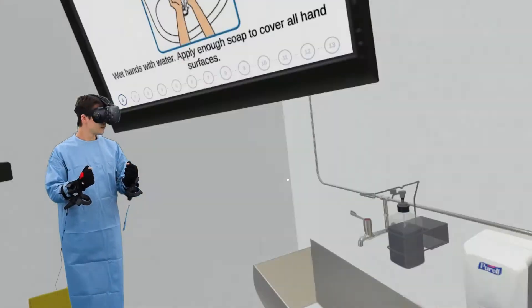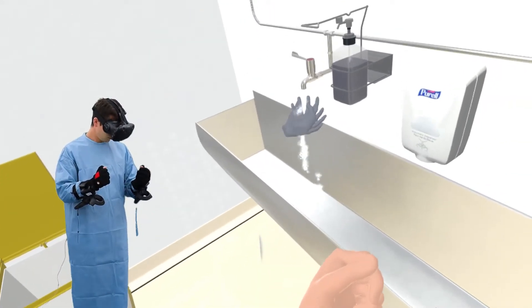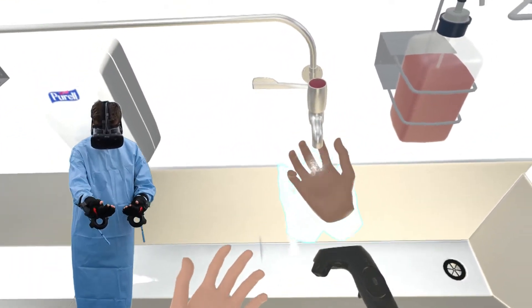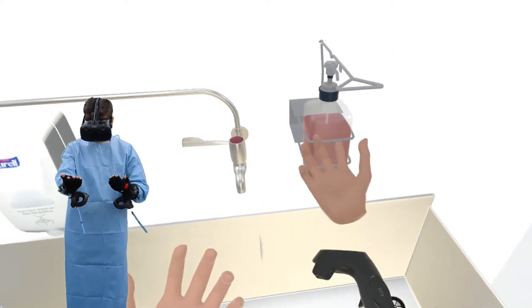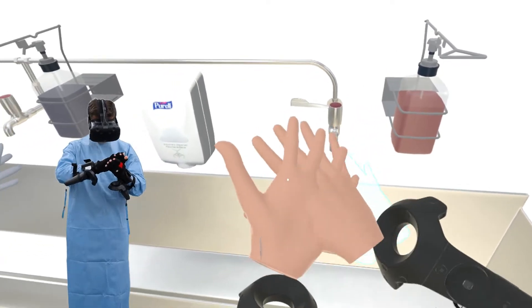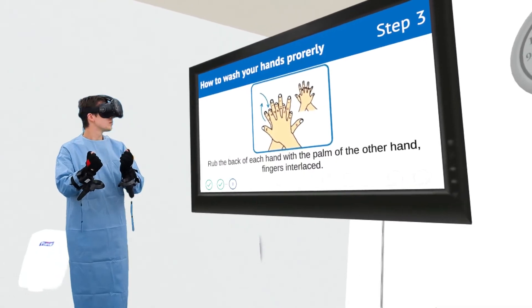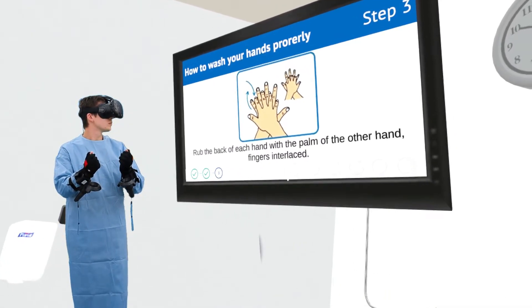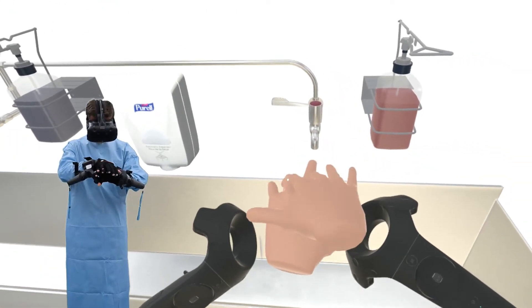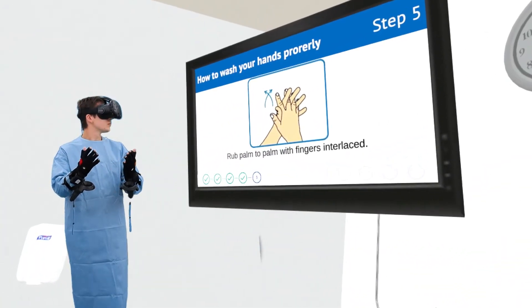Wet hands with water. Apply enough soap to cover all hand surfaces. Rub hands palm to palm. Rub back of each hand with palm of other hand with fingers interlaced. Rub palm to palm with fingers interlaced.